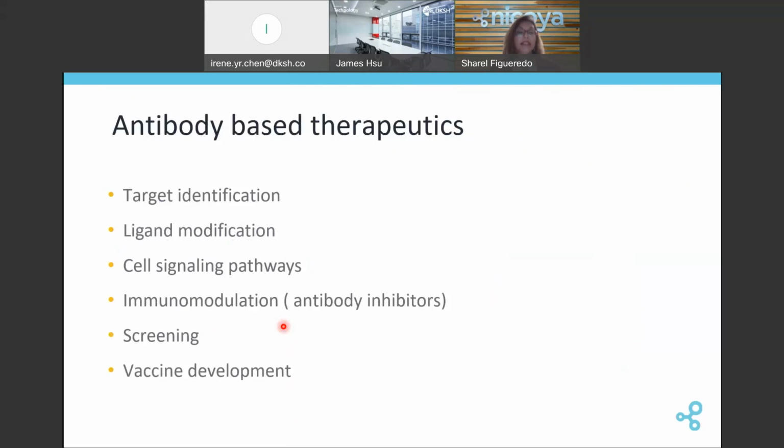Now, antibody-based therapeutics have been a central focus in drug discovery and development. Mechanistic studies provide insight into the function of antibody-based therapeutics. Advanced analytical tools have accelerated the characterization of these antibody-based drugs, proving them to be safe and effective.